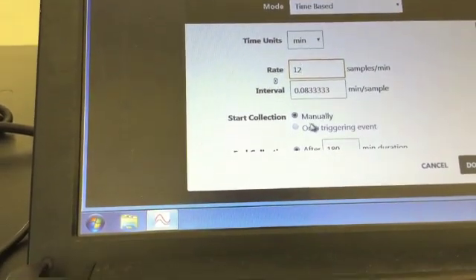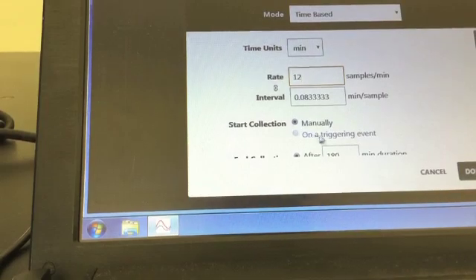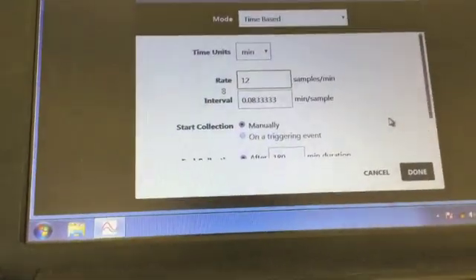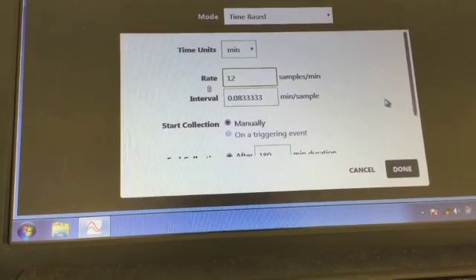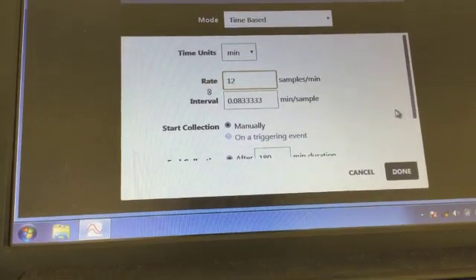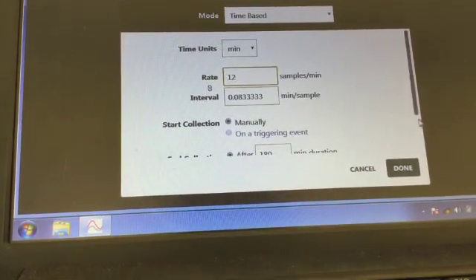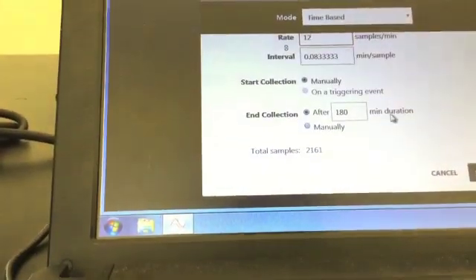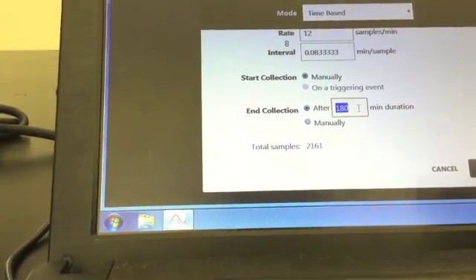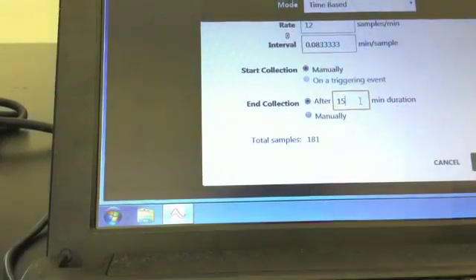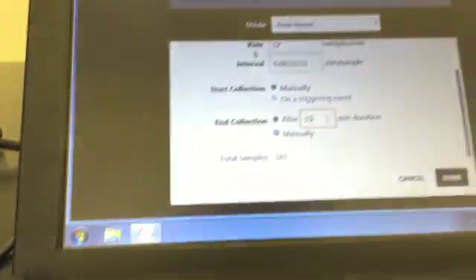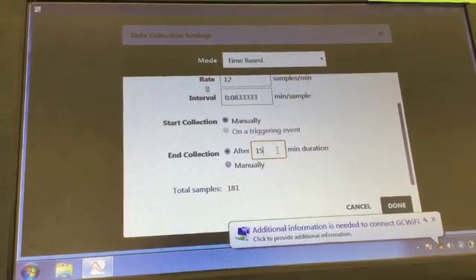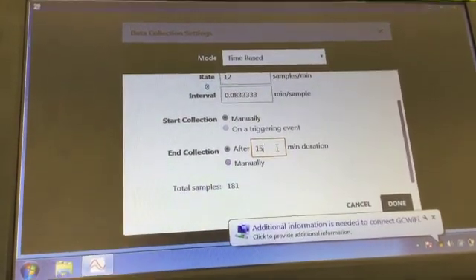You want to have the data collection started manually so you can tell when it starts. Scroll down and tell it to end collection after 15 minutes. You probably will not go this long, but this will give you sufficient time to collect the data you need in order to have good results.